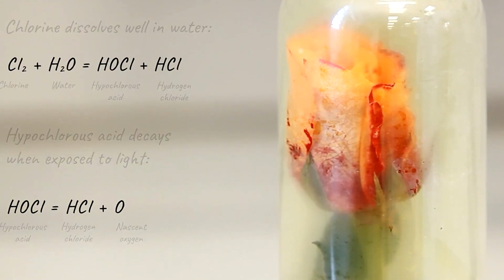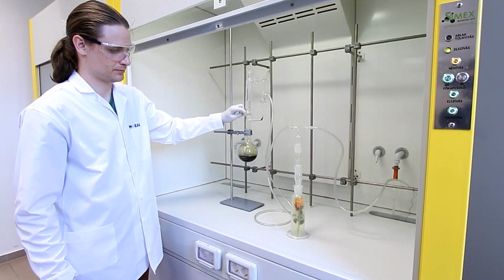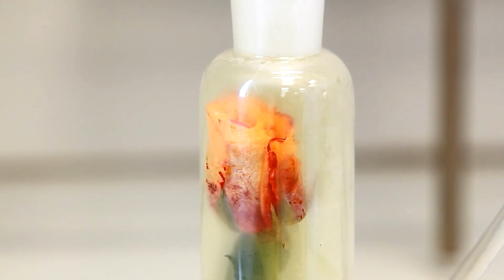It is nascent oxygen that is responsible for everything, as it is highly reactive and can therefore easily break down substances. It is responsible for the loss of color in our rose, too. It breaks down the organic pigments in the rose petals.